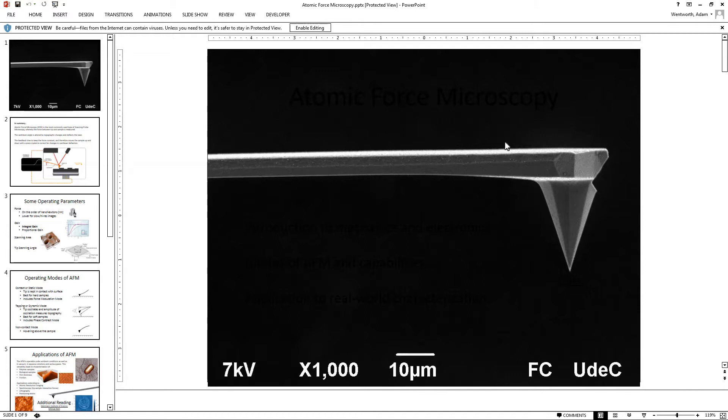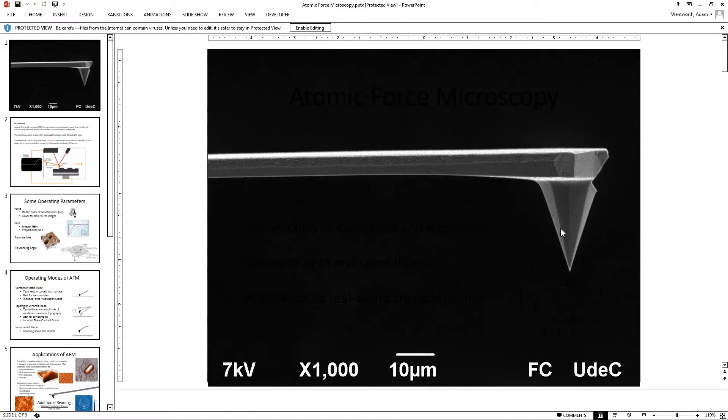infrared laser. And then we have a silicon nitride tip on the end of this cantilever, and that's what we use to do our scanning probe technique. This could also be diamond, and they have various shapes and radius of curvature at the end of these cantilevers, at the end of the tips.